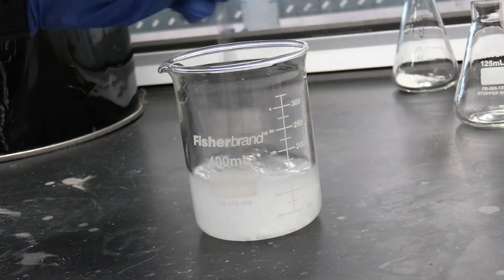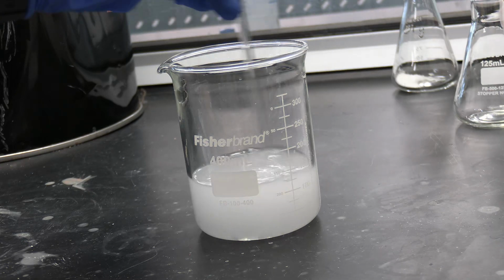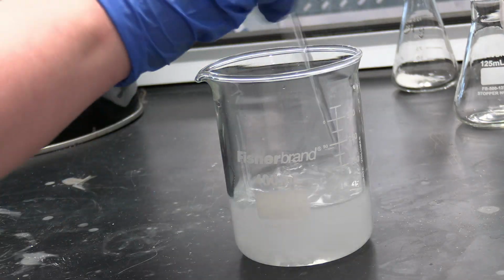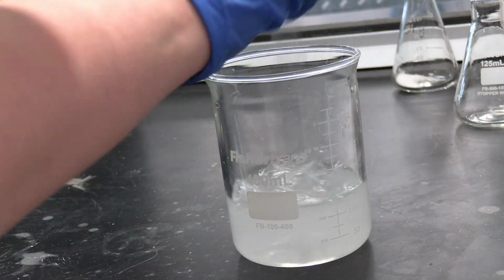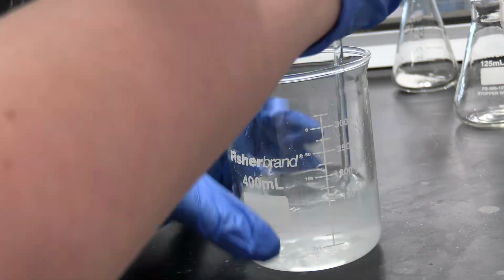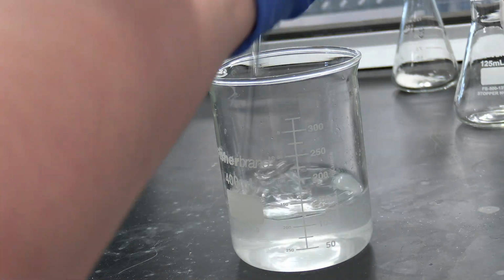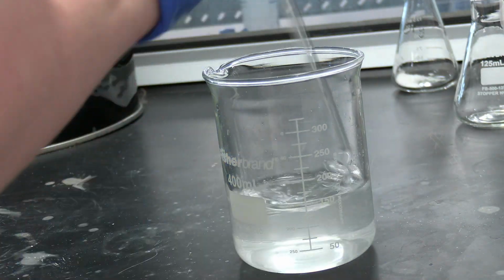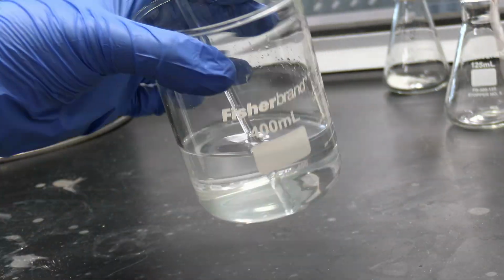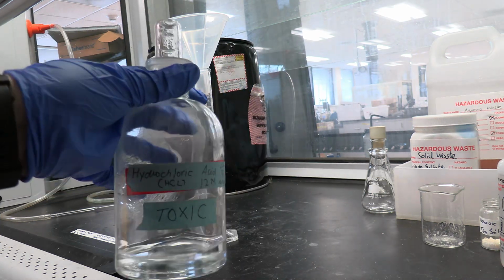Then, once I have 120 milliliters of water, I can add to it the solid sodium hydroxide. This reaction is exothermic, so not only does it release heat, do not hold it close to your face as you stir, as it is not safe to breathe. I would recommend using a stir bar on a heating mantle or stirring manually with a stir rod and leaving the beaker on the hood bench. At first, the solution will be white in color, but it will slowly clear up and the reaction will be completely done.